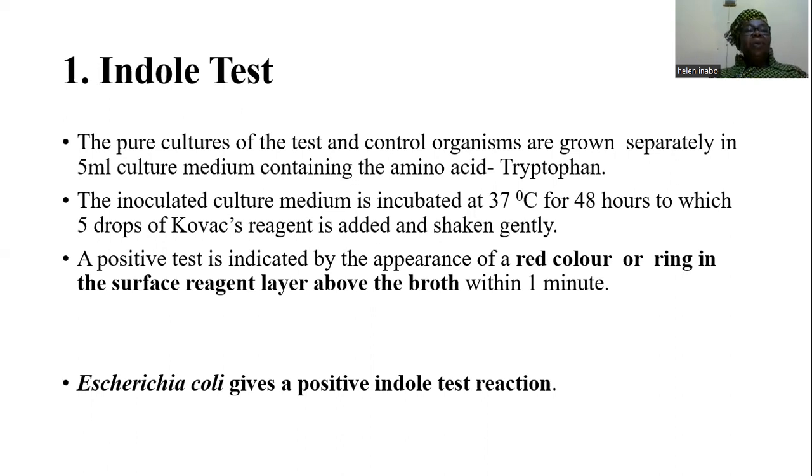What is the principle behind the indole test? The test organism should be able to elaborate an enzyme known as tryptophanase, which degrades tryptophan in the medium to 3 products. These include indole, pyruvic acid, and ammonia.